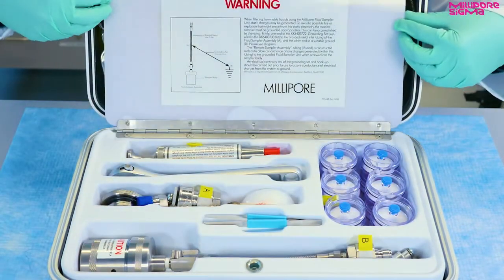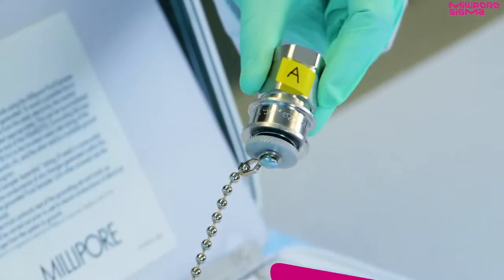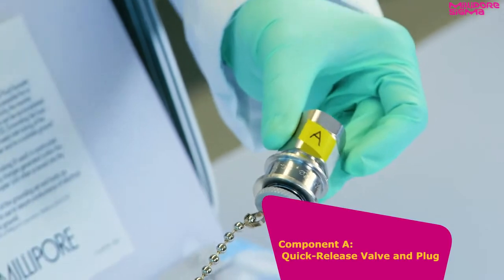Each component is labeled with a letter corresponding to the component parts list on the operating instructions. Component A is the quick release valve and plug.